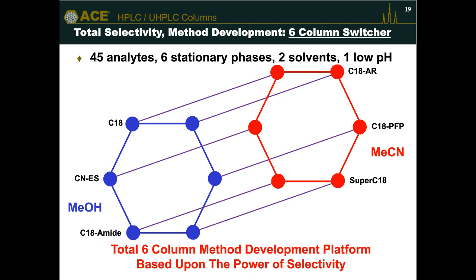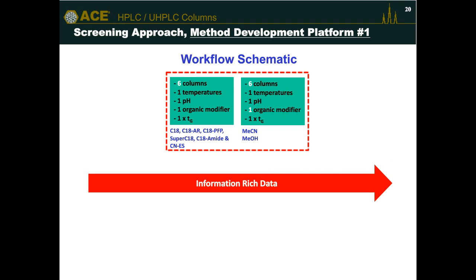And I'll show you an example now of how we can use this as part of our method development strategy. So if we consider the 5 boxes that I showed you earlier with the different parameters, we can actually reduce those boxes now just down to 2 parameters. We have column chemistry and we have organic solvent. So we've greatly simplified, and if we have the equipment, we can automate with column switches and solvent switches. We can automate this column screening process. This gives you productive method development.